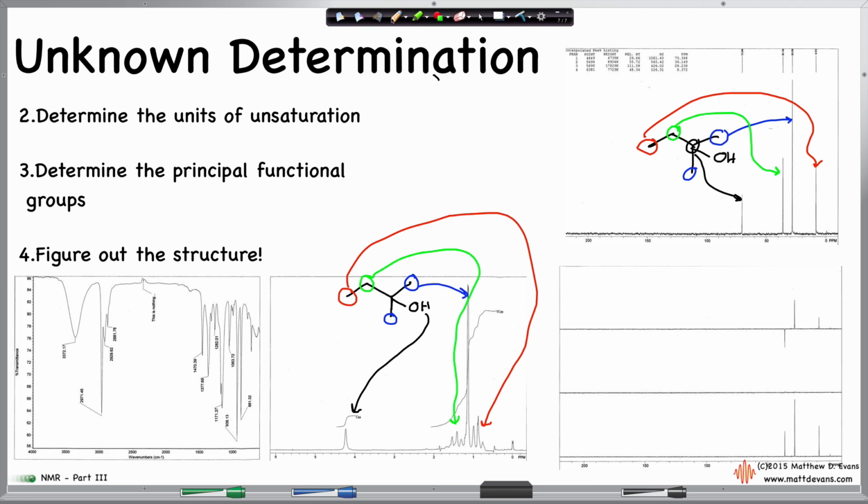Okay, so sometimes they make you do this on the IR spectrum, sometimes not. It's a little bit trickier here because it's going to be hard for you to know what I want and what I don't want. But of course, the OH bond is the most significant piece of this infrared spectrum, and that's going to correspond to that. That's pretty much all I would want you to mark on the peak assignments. But this is something we always do in spectra. Whether it's the laboratory or the lecture, I always want you to do these peak assignments, and you'll see that on the exam, the practice exam.